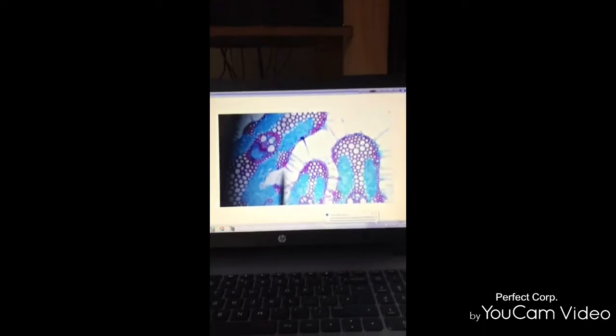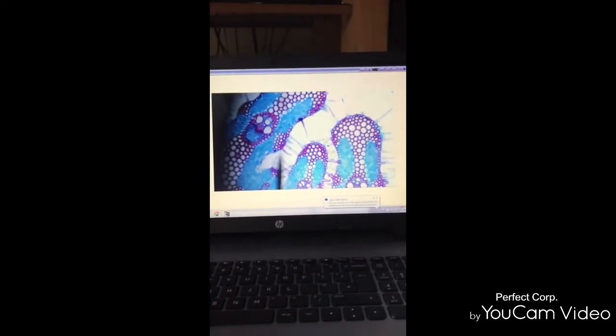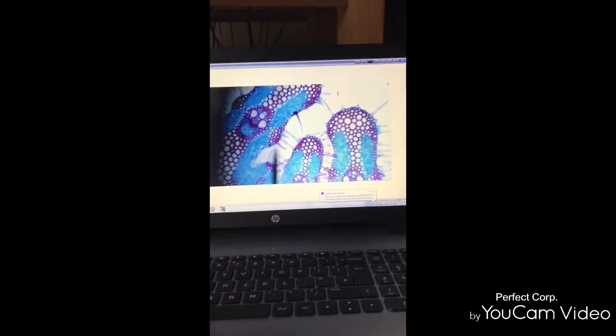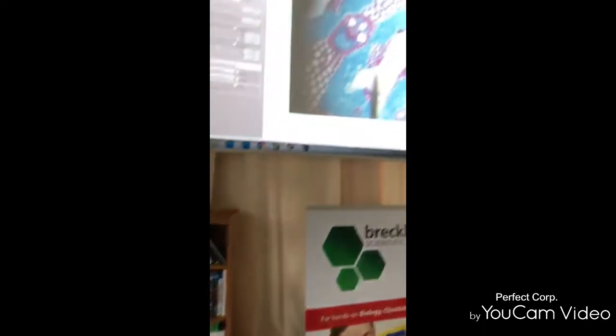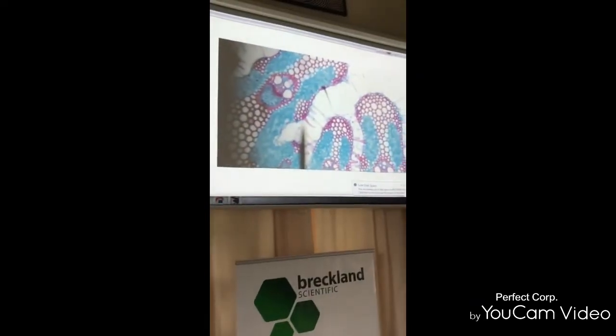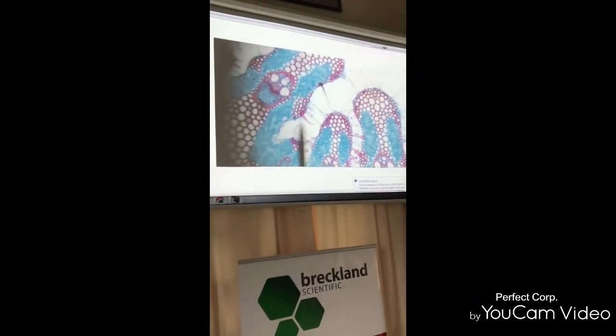So compare what you are seeing on the laptop to what you see on your projector.